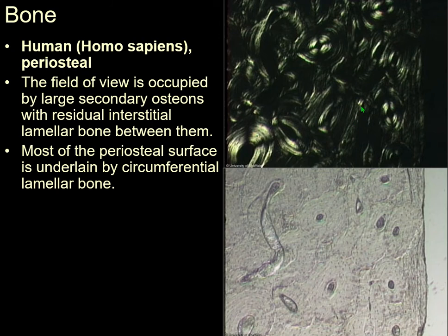This is another bone with some osteons. Lots of lamellar bone on the outside, showing how this individual was continuing to grow. The outside of the bones possibly getting stronger or getting bigger, and that's the growth from that, whereas this is simple remodeling after it has achieved an appropriate size.